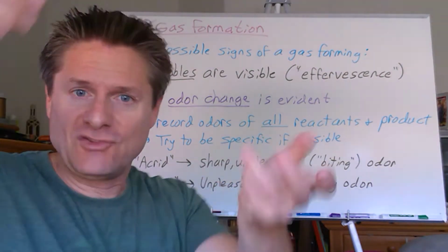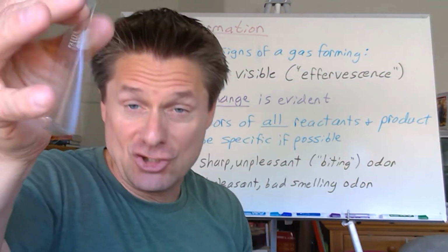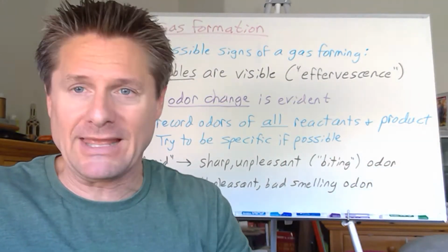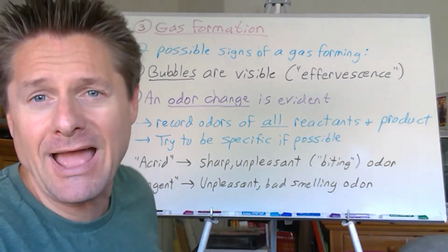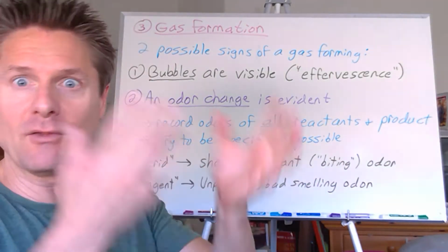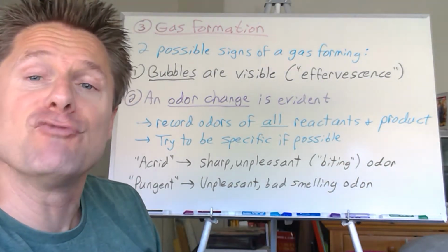Once you mix them together, shake it, right? Make sure you shake it. And if you see constant bubbling for a limited period of time, think like champagne bottles, or pouring soda pop, where you see all those bubbles come, that would be the indication that you formed a gas.